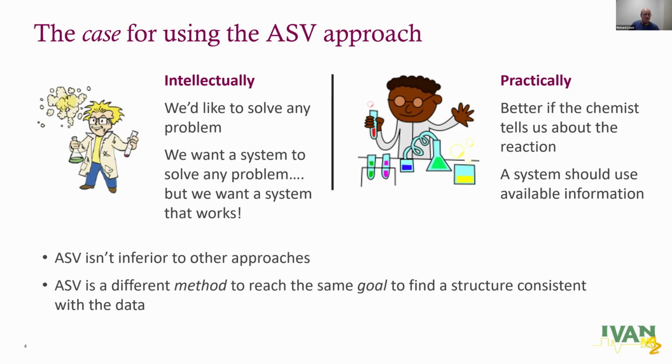So what I want to say is, don't think that ASV is inferior to other approaches. Just think of it as a different method to reach the same goal. And the goal is to find a structure that's consistent with the data.